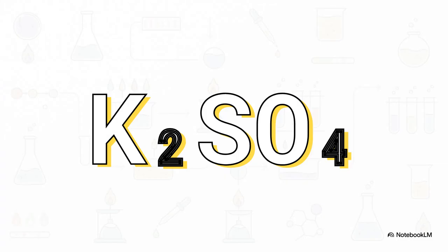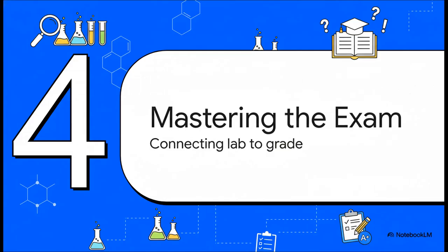So let's put it all together. Our positive ion was potassium. Our negative ion was sulfate. So our mystery compound is potassium sulfate. Chemical formula, K2SO4. See? By just following the clues and the procedures logically, we figured it out. Job done. But hold on, this is way more than just a fun lab experiment. This stuff is crucial for your exam.